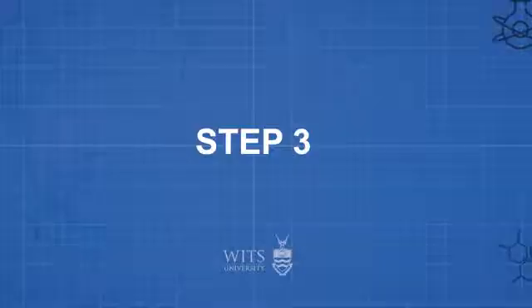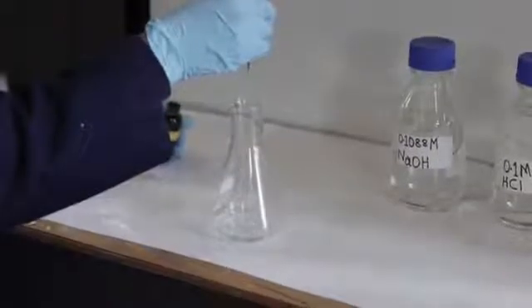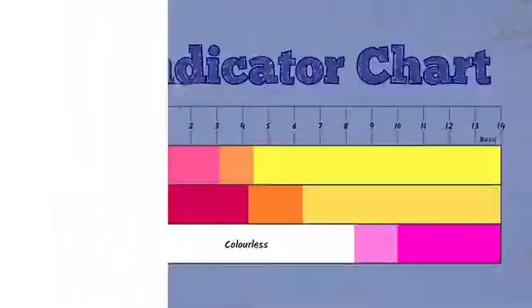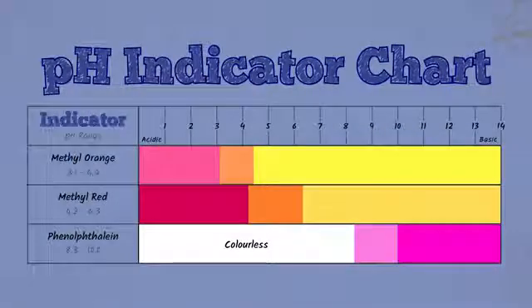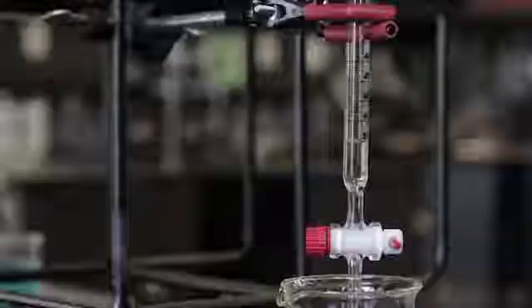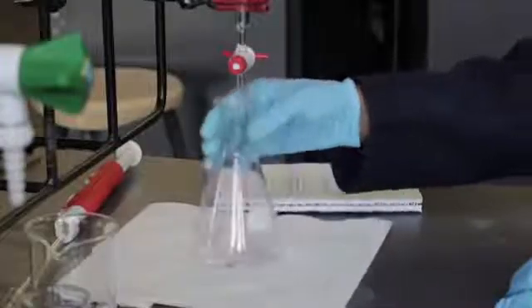Step 3. A few drops of an indicator may be added to the conical flask. This will show a change of color once we have reached the endpoint or when the titration is complete. The following indicators will be used in your practicals. Step 4. A second solution is placed in a burette. This is the titrant.